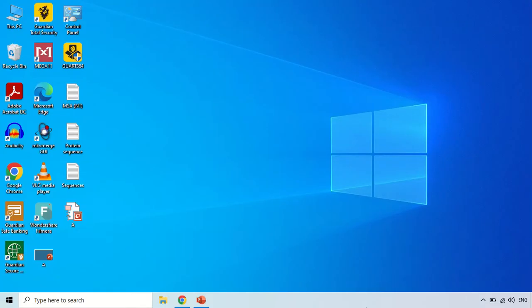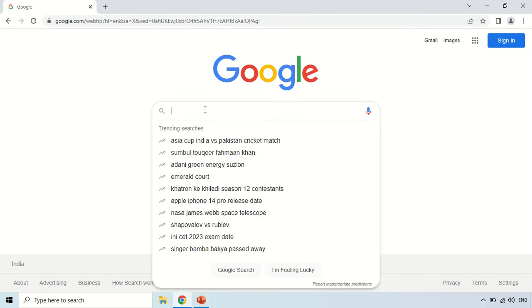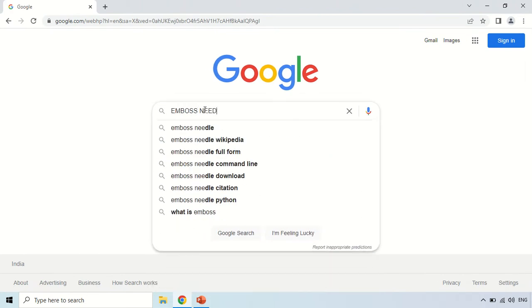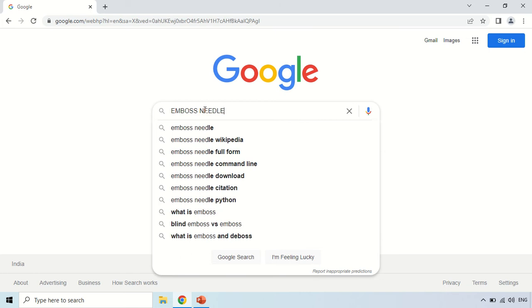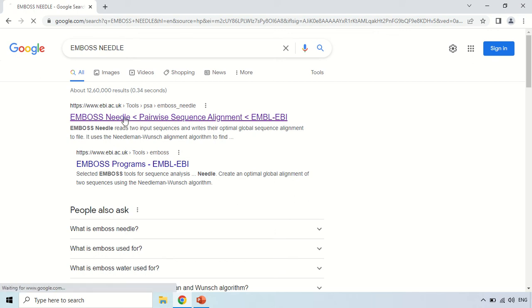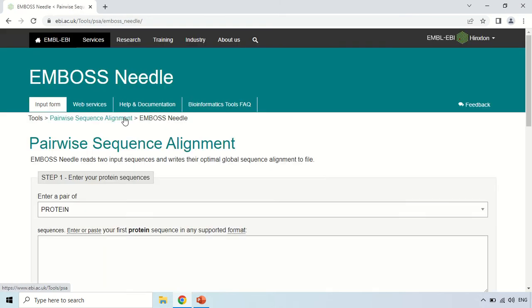In order to use EMBOSS Needle, just open your browser and search for the tool. The first website that is ebi.ac.uk is the main website of EMBOSS Needle. Just click here, and this is the homepage of EMBOSS Needle.